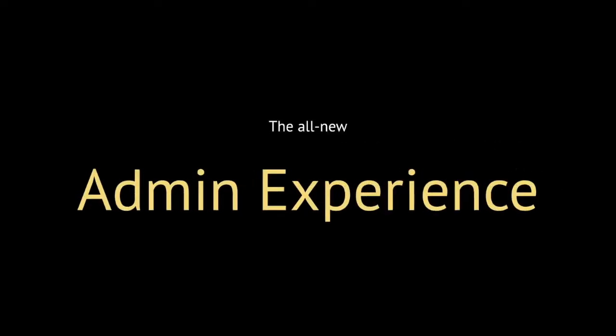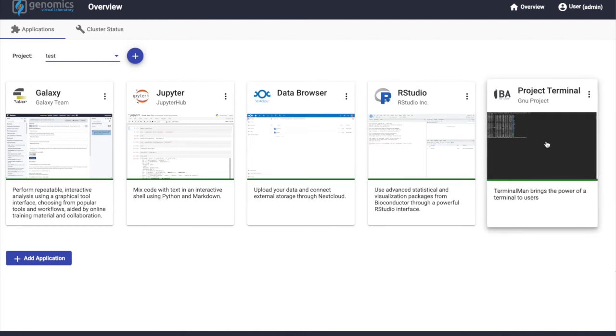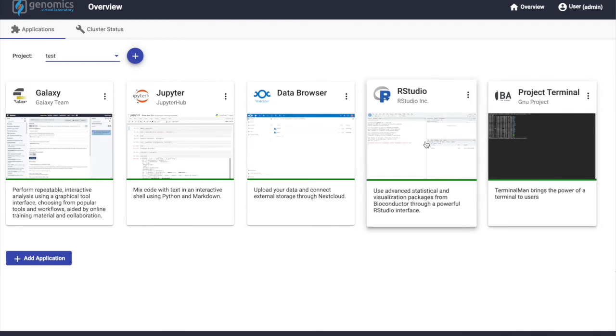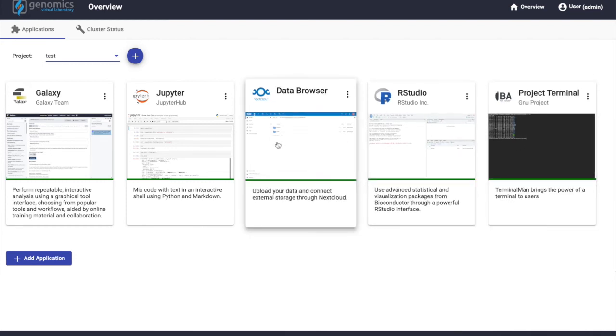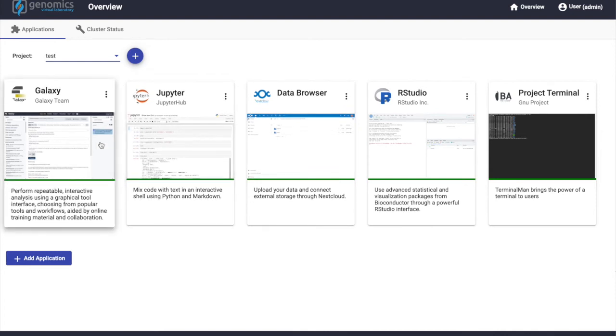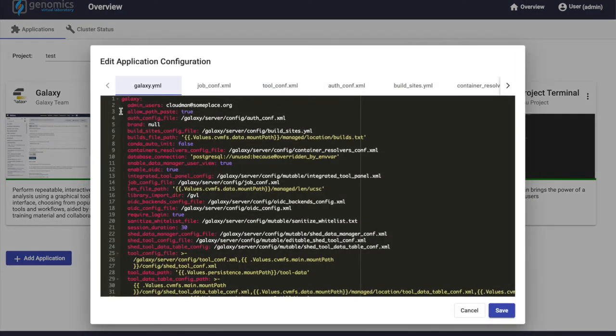In addition to the user experience, let's take a look at the administrator experience, so the person that will launch the GVL and provide it as a service to their researchers. As an administrator of the GVL, your experience revolves around the CloudMEN application. Here, we see access to all the same applications as the researcher has access to, but we also have extra capabilities such as editing settings for the applications that integrate so deeply.